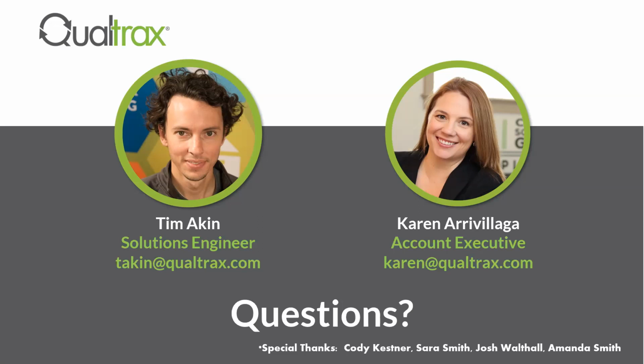So it's all through the UI, all done by your system admins, and pretty easy to learn. You've got to be willing to learn how to do it. That's definitely a plus, but very, very fun to do once you get it. That was my main role at the lab that I worked at, building these processes for us internally.